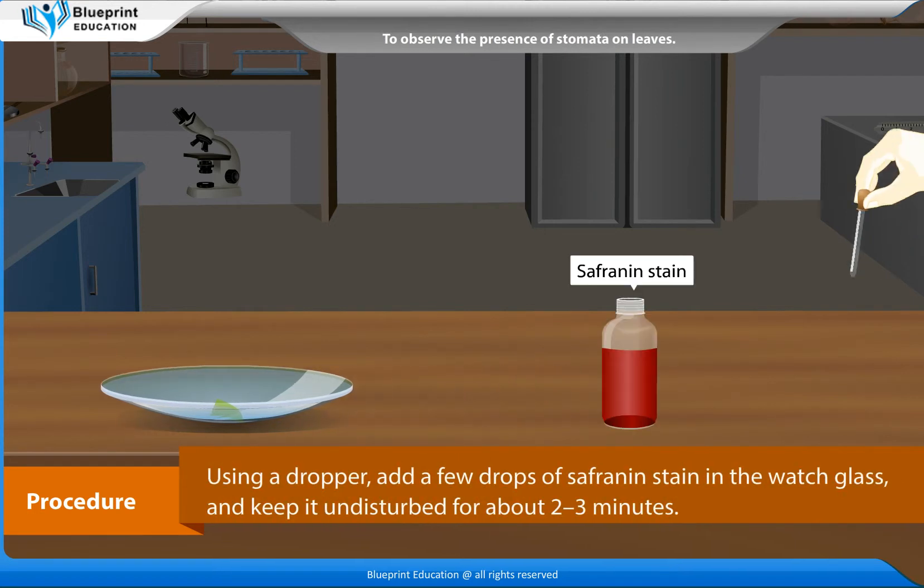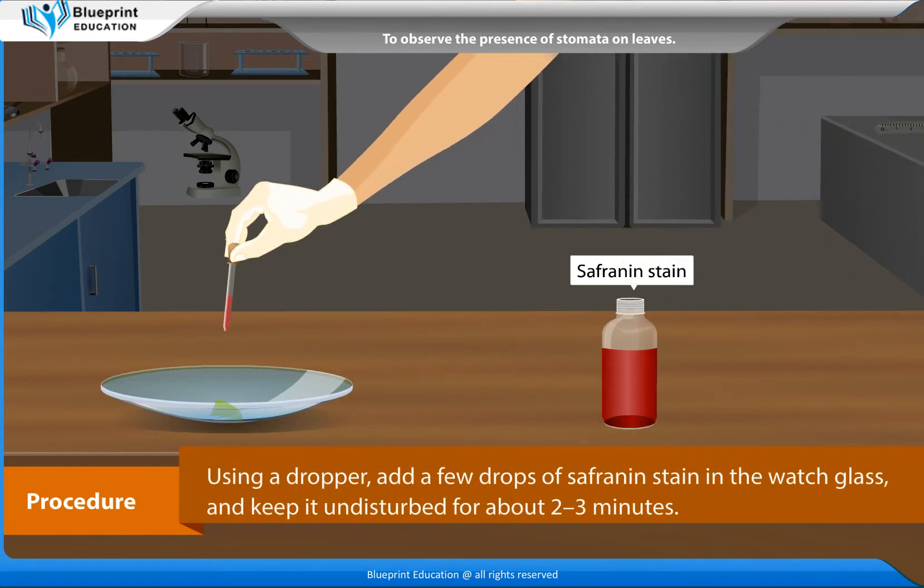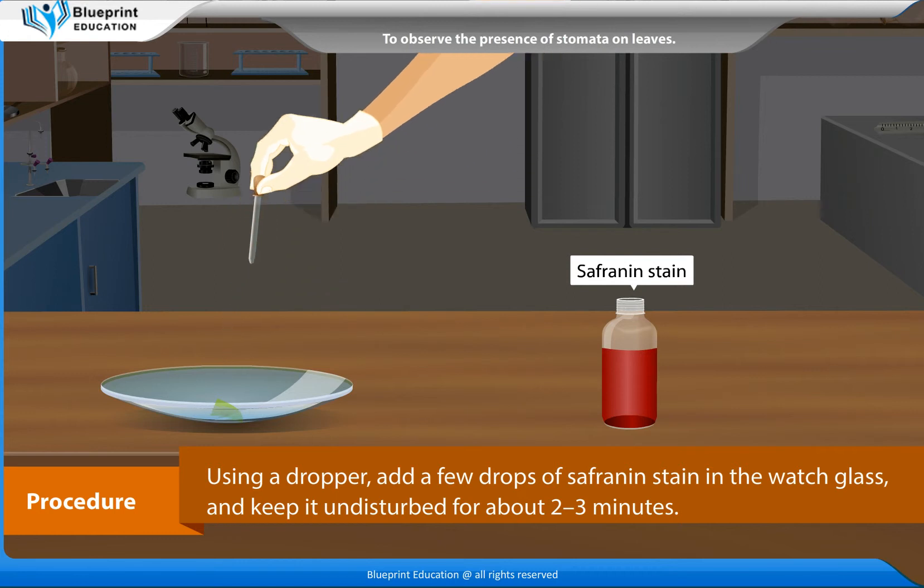Using a dropper, add a few drops of saffronin stain in the watch glass, and keep it undisturbed for about 2-3 minutes.